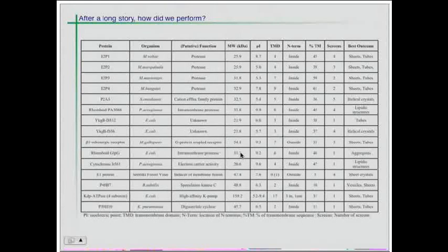So either because the proteins have been optimized and are good expressors and are stable in detergent, or because the screen is able to cover substantial amounts of crystallization space, we get a relatively high success rate. Many of these we are now rerunning screens to improve the diffraction quality of these crystals, because of course that is the next step. First is to find the conditions where you can potentially obtain good crystals, and then to really improve them and to make them very large and optimal for structure determination. That's the next step.